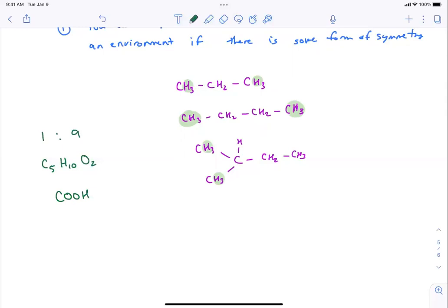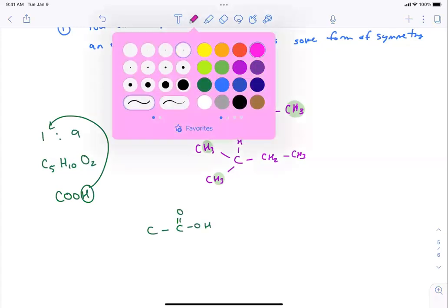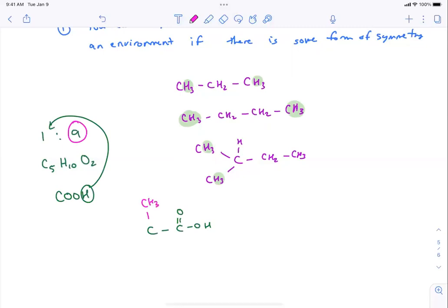That also makes sense because this H is that one hydrogen in its own environment. That means all other nine hydrogens had to be in the same environment. So there had to be some symmetry there. So you have this, and then what must be true here is that they must all be the same. And that's how you get nine. So when you get a number greater than three, there's branching or symmetry across the molecule somewhere that is causing that.